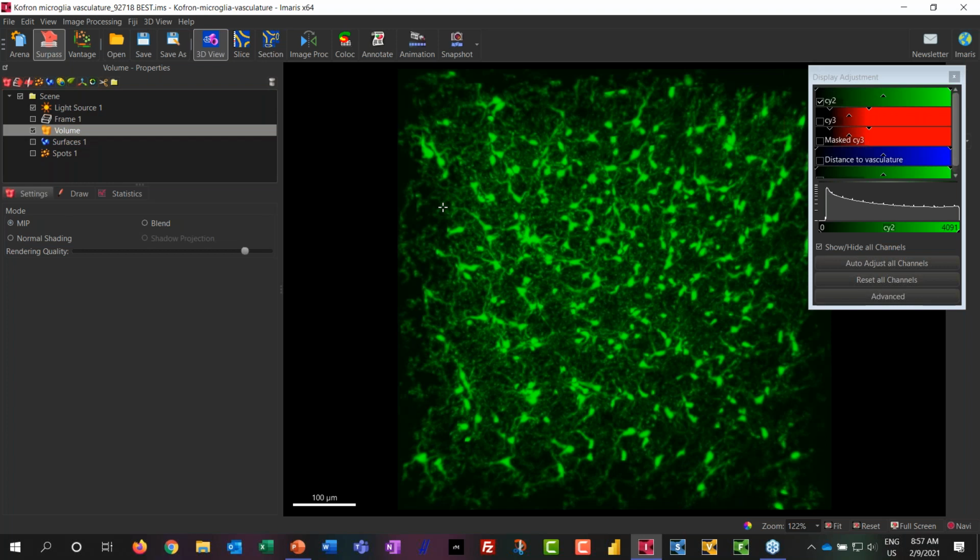No. Someone has made an extension, which is a plugin, if you have the XT module, to look at contact surface area, but we don't have that natively within Imaris. It is something that I'm personally interested in. I've helped a number of users do that sort of work when I was a salesperson, and it was something I was interested in in my former scientific life. We don't have that within Imaris yet, but it is definitely an interesting next step that we could take.